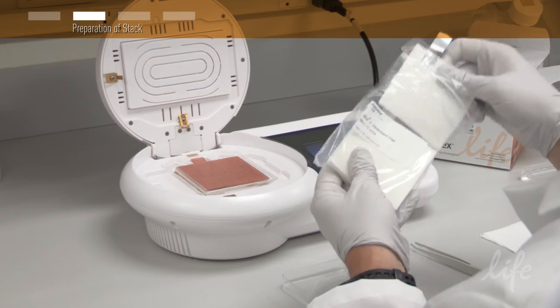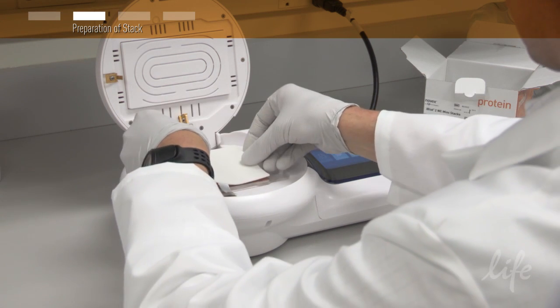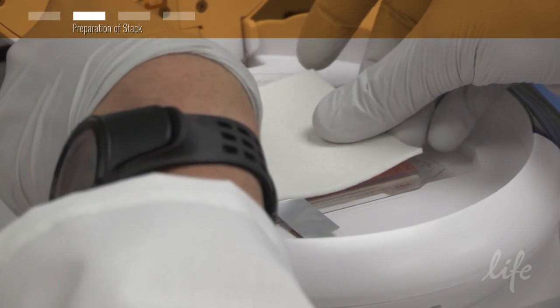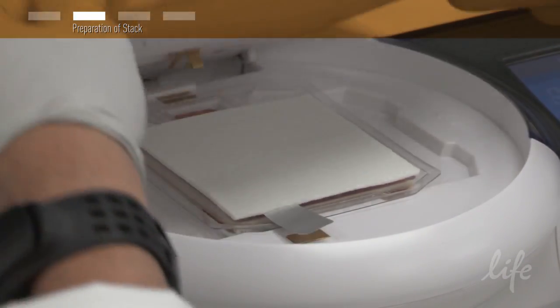Place the absorbent pad on top of the top stack and again, be sure that the electrical contacts are aligned with the corresponding contacts on the blotting surface. Then, close the lid.